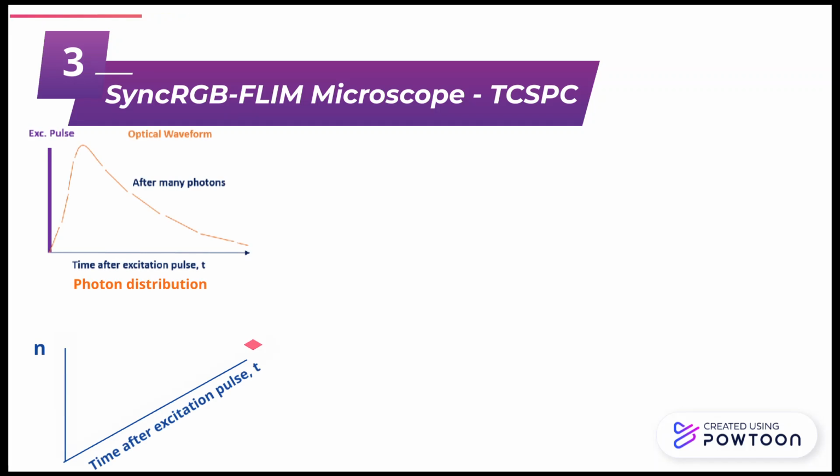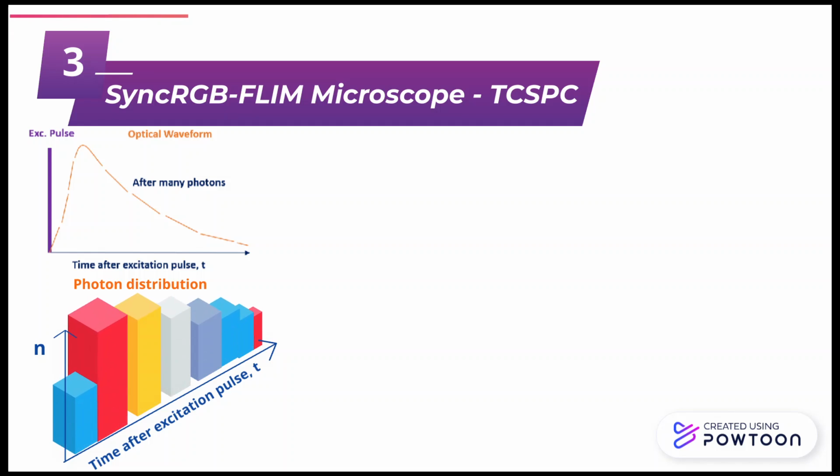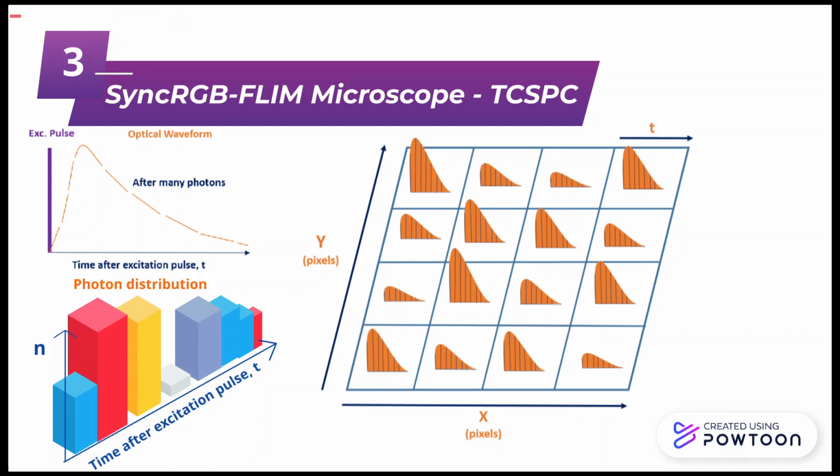The data recording is based on detecting single photons of the fluorescence light and determining the arrival time of the photons with respect to the laser pulses, as well as the position of the laser beam in the moment of photodetection. This results in a photon arrival time histogram for each pixel in a two-dimensional scan.